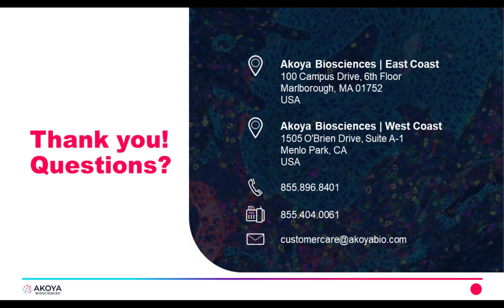In the images that I showed in this presentation, the average time for the experiment on the instrument was roughly 8 or 9 hours, and then you're looking at another couple hours of processing, which of course can be running on a different computer while your CODEX machine is still doing something else. We really haven't done a large majority of analysis yet, so I can't really speak to that. It depends on how granular you want to get, but from start to finish, you're probably looking at least 12 to 15 hours of getting the data out.